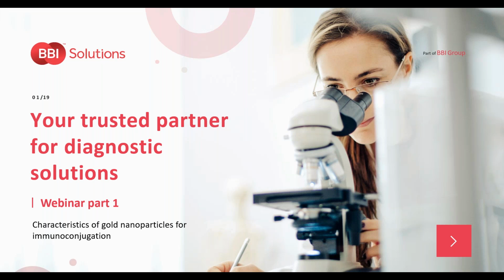Myself, I'm Nikki Robinson. I've worked at BBI for 25 years, overseeing the production of the gold nanoparticles and also working on the conjugation, primarily of antibodies to those gold nanoparticles. And in the last year, I've also moved over to technical support. So we're going to start with Chris, and he's going to take you through the surface chemistry of our gold nanoparticles.